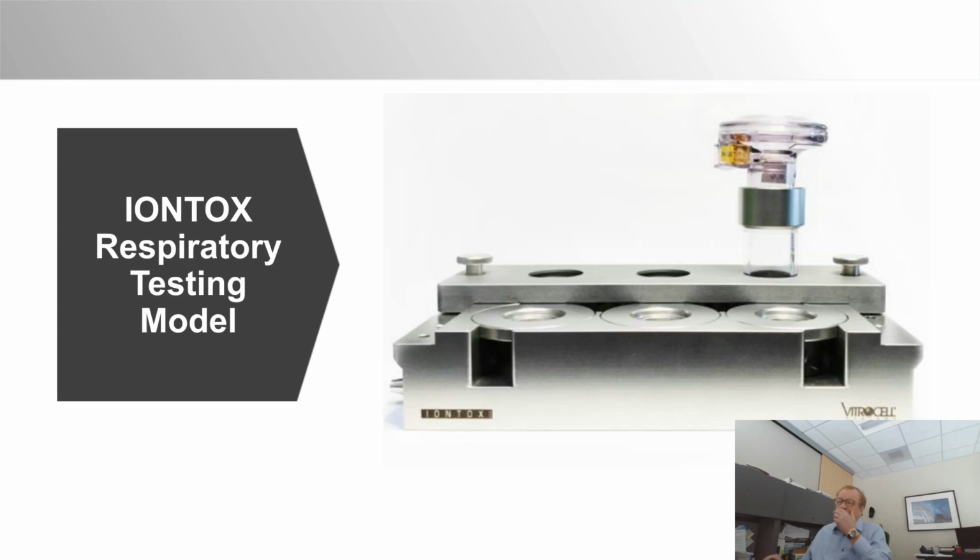And then lastly, I just want to introduce, we have partnered with Vitrocell to develop an in vitro way to expose the 3D lung tissue on the plate to aerosols and vapors. And this is just an example of what that system looks like.